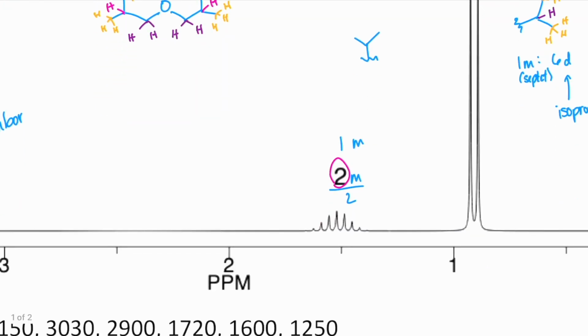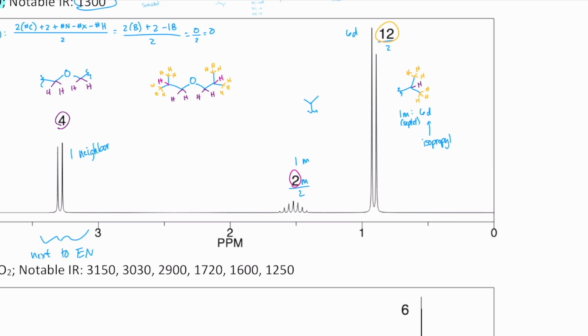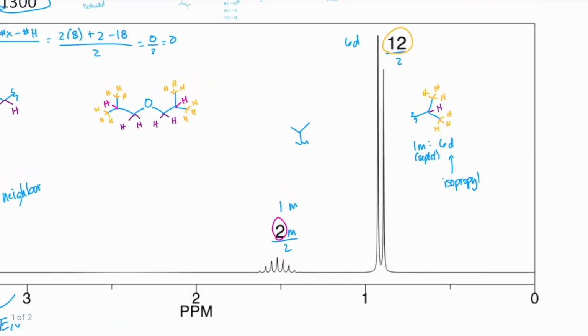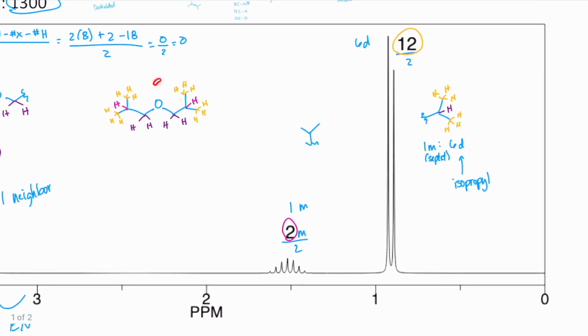And we can see that here. This hydrogen is not quite in the alkyl range, or it's in the alkyl range, but it's pretty high for an alkyl range. It's not low like this one, which makes sense because this hydrogen is closer to the oxygen than these orange hydrogens. Okay, and then we also can see our splitting pattern makes sense. It's a symmetrical molecule. We draw a line down the middle. It's the exact same.